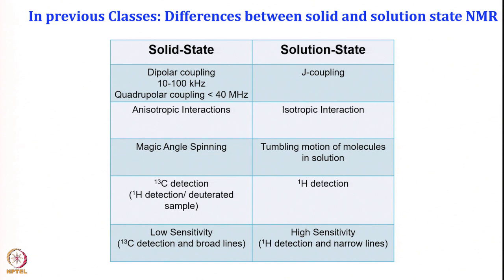Okay, good morning. So welcome to today's lecture. We were discussing the basics of solid state NMR and how we can apply this in structural biology. If you remember, in the previous class we discussed the differences between solid and liquid state NMR.